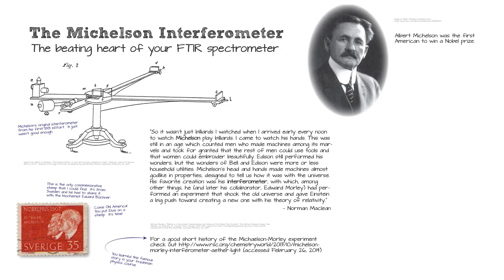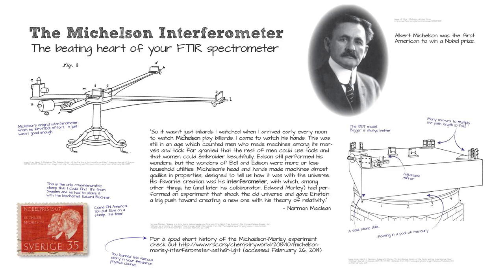So there we see German craftsmanship, fine design, curvy lines. I bet those knobs on the screws that move the mirrors were like works of art. Well, here's American craftsmanship. It's a slab of rock floating in a pool of mercury. It's huge. It's tough. It's like the Mustang to the Lamborghini, right? I mean, it's big, it's powerful, it's got a giant engine. This was very stable. That giant rock was not going to vibrate.